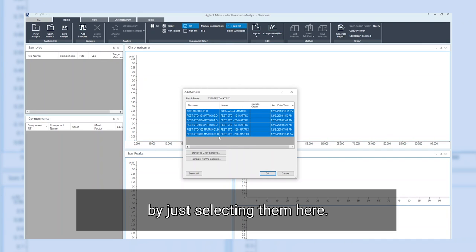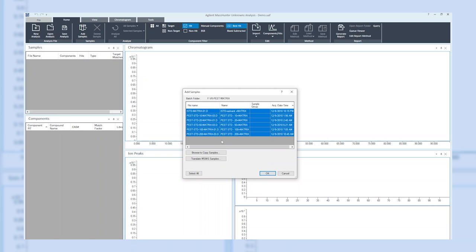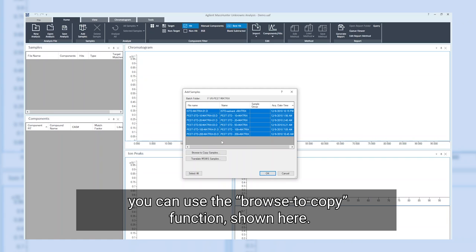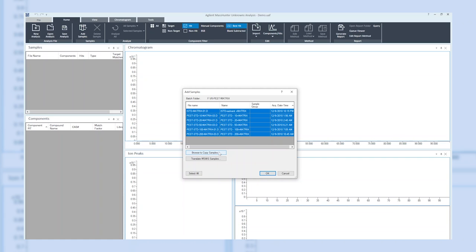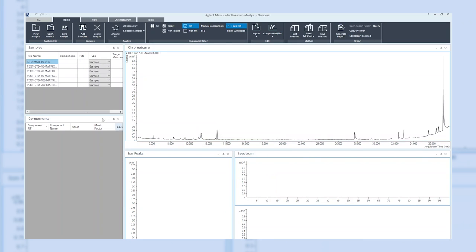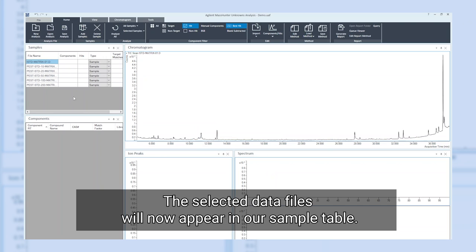Now we can add samples to our sample table by just selecting them here. If you want to analyze different files from different locations within one batch, you can use the browse to copy function shown here.